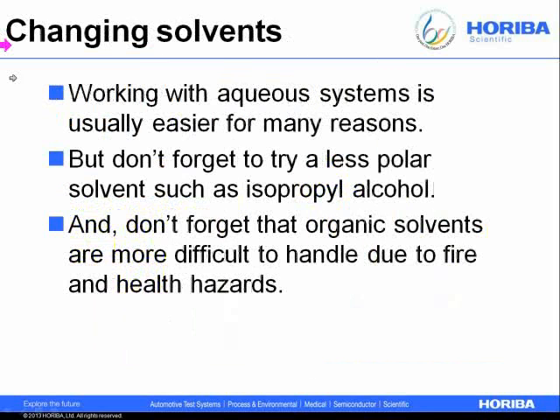Now, keep in mind that you don't have to work with water. First, I love water. I swim in it. I drink it. It's safe to work with compared to other liquids, and so that's generally where we start. But don't forget there are other less polar solvents, such as isopropyl alcohol. You can move over to organic solvents like toluene, dimethylformamide.